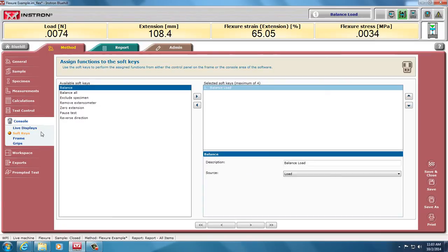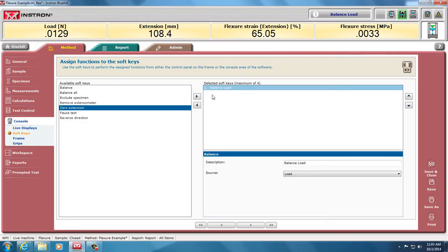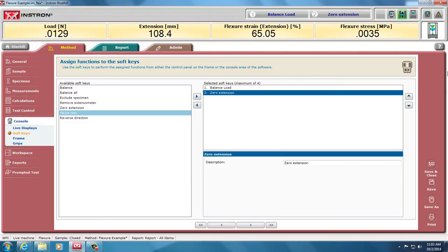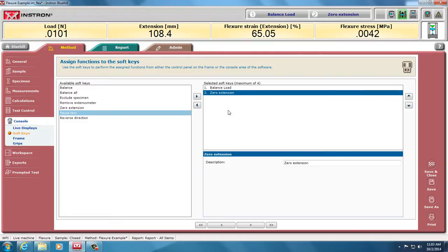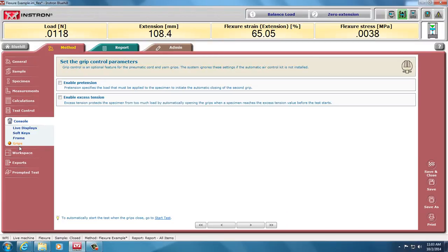We can also set soft keys. So here we have balance load at the top. These are also the keys on the actual physical console. I would like to also have a zero extension key up there, but that's also usually on the side here. So I can balance my load and zero extension. I've already balanced my load, so I'm not going to use that again, but I will for each sample once I put a tear load on, zero the extension. There's some information about the frame and the grips. We don't have those special grips, so I won't go into that.